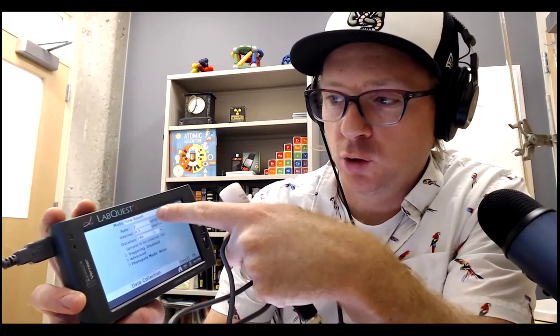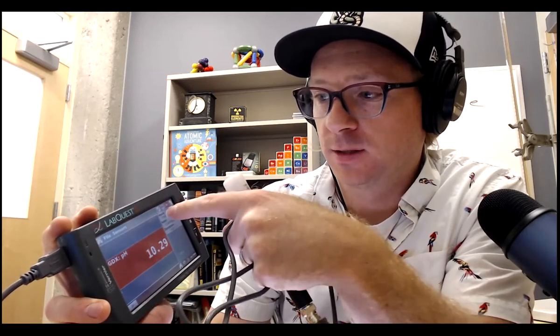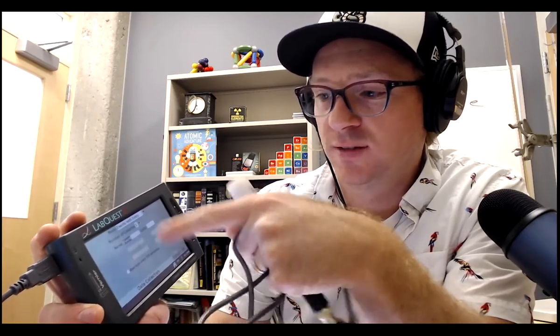And then up here in mode, you're going to switch to events with entry. So you click down on this little arrow, and the second one is events with entry, because you need to tell LabQuest every volume that you add. Let me actually just do it. So mode, events with entry, and then you could just leave it like this, or you could say the volume and then the milliliters, and you hit OK.